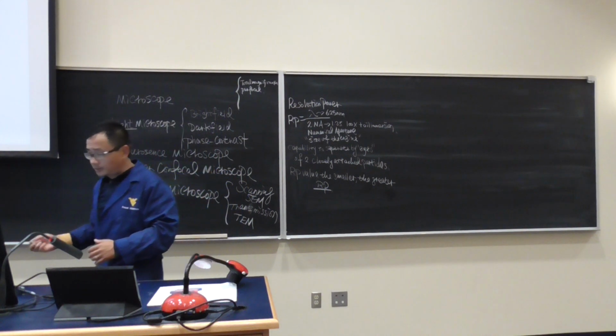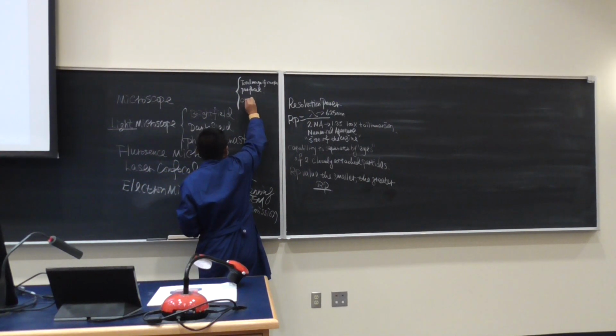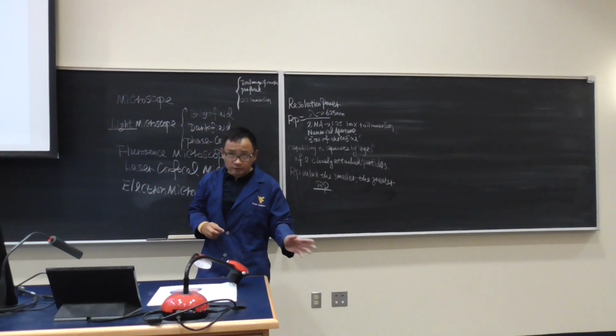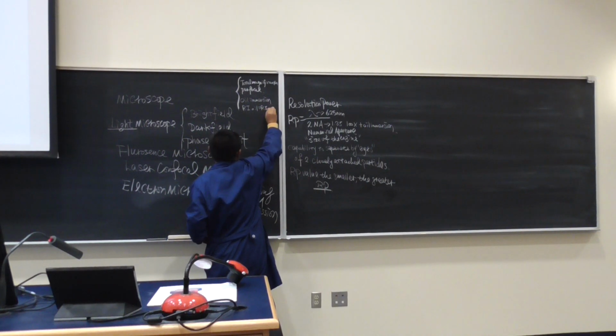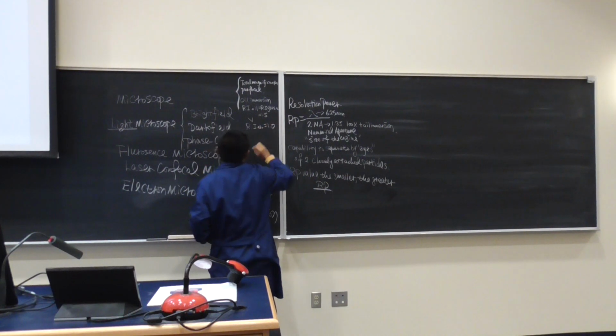And we also talked about a very important method we have to do, which is oil immersion. Why is it so important? The slide tells you, because there is light refraction when the light passes through different media, and for oil immersion, the refraction index of oil equals the refraction index of glass, which equals 1.5, which is larger than the refraction index of air, which is 1.0.